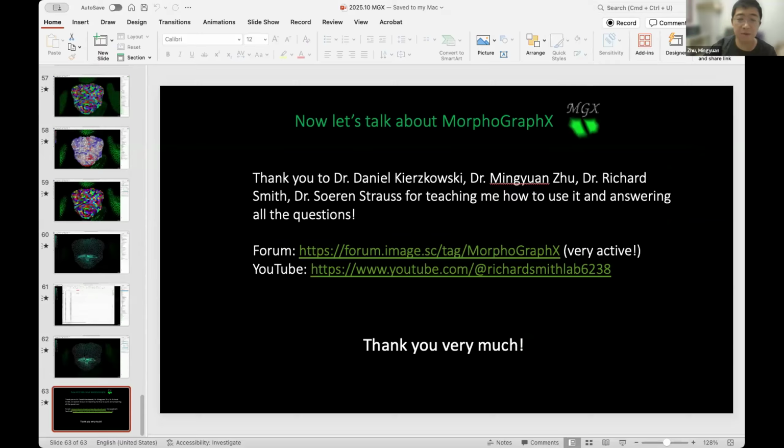Great. Yeah, thank you, Mia, for showing the workflow very beautifully. And we do have one question from the audience. The audience is very interested in knowing how to optimize the confocal image quality for better surface reconstruction in MorphoGraphX. So do you have any suggestion when you collect the confocal image for that?